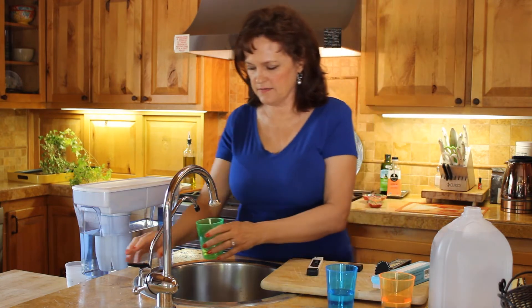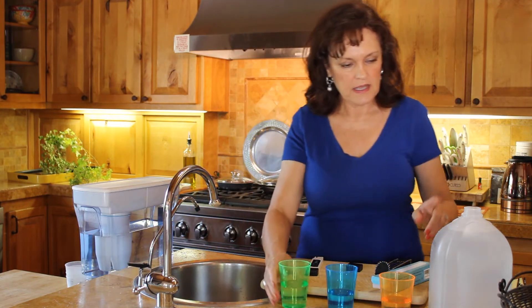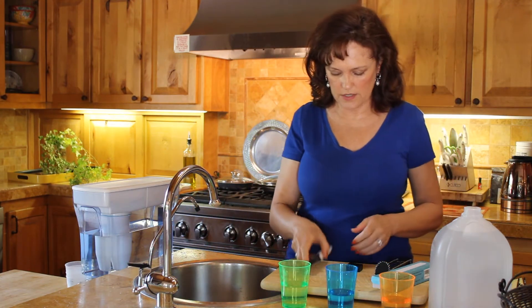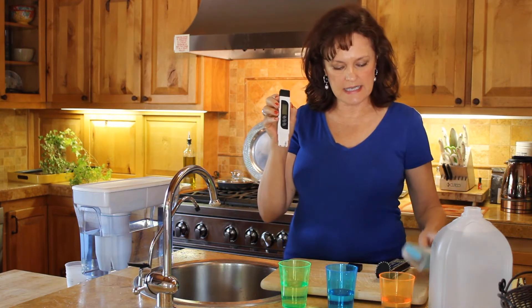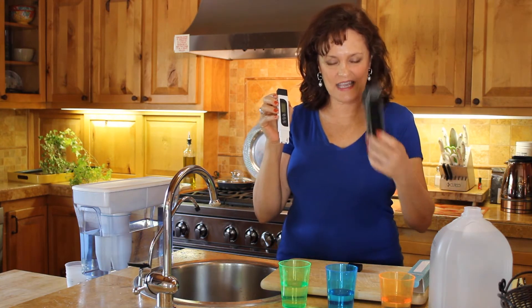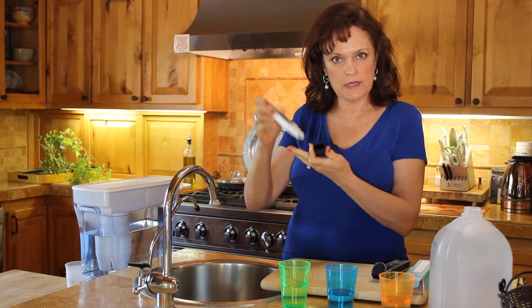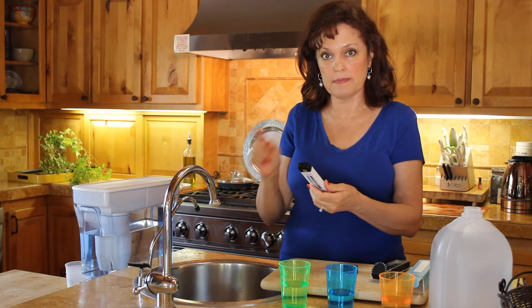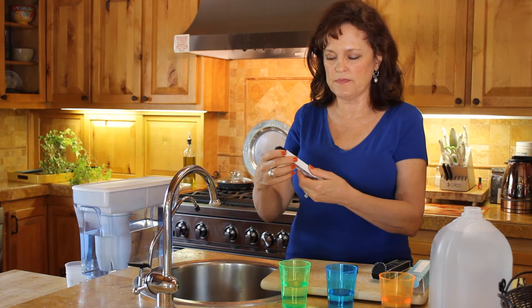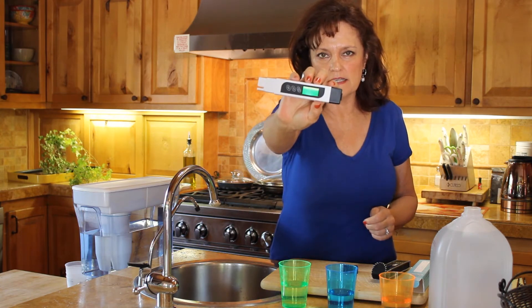So we have our tap water here, reverse osmosis water here, and our distilled water. I've unpacked our TDS meter — it comes in a nice case and you would keep it covered to keep the components safe. I'm going to shake it out a little bit so there's no excessive water in it. Right now you'll see it's green and it's zero.